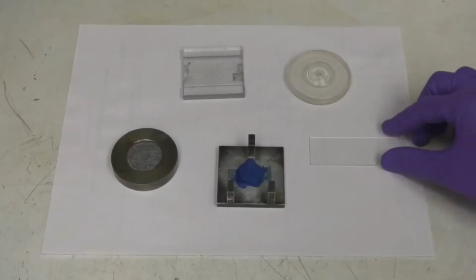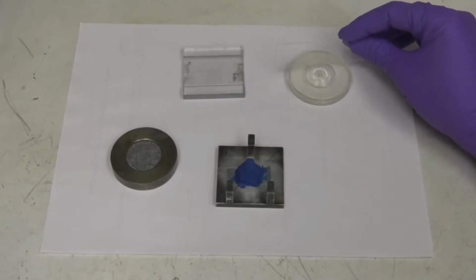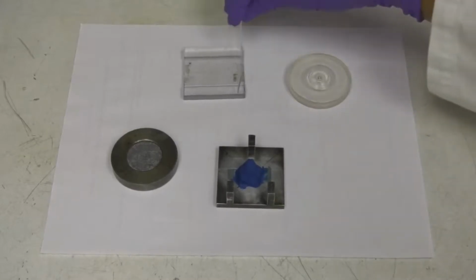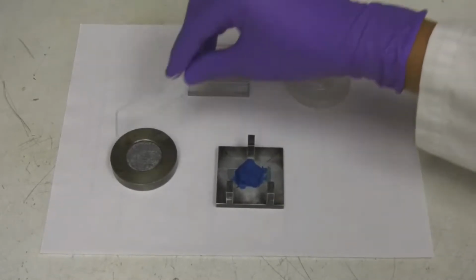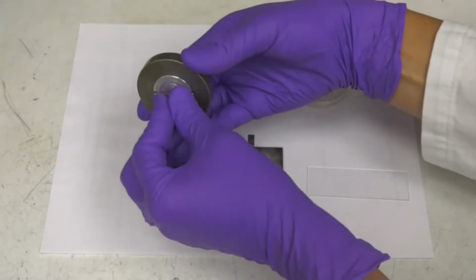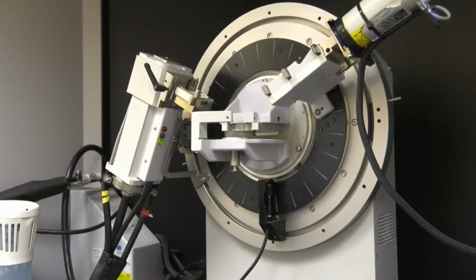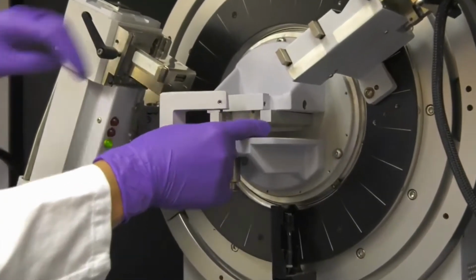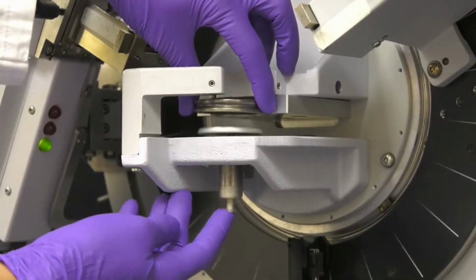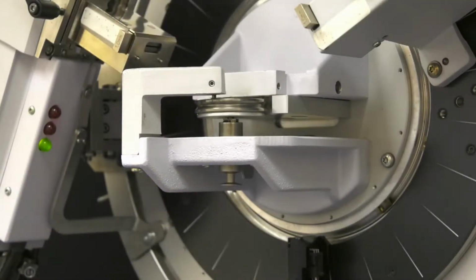There are various types of sample holders for different samples. No matter what type of holder is used, it is important that the surface of the sample is flush with the top surface of the sample holder. This sample holder has an adjustable stage to change the height of the sample. After loading a sample, the sample holder is placed onto the base of the sample stage fixture. The sample holder is lifted up from above so that its top surface is flush with the top of the sample stage. Then, the sample stage fixture is gently pressed up, locking the sample holder into position.